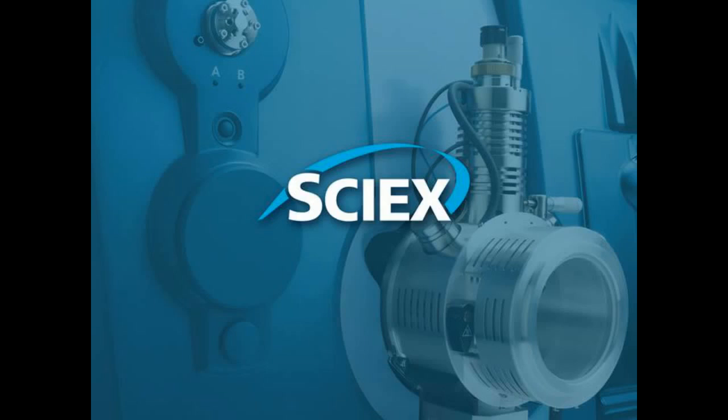Our first question, in the separation of the phosphorylated sugars, how much of each analyte is injected into the capillary? Well, I suppose you're looking at the injection of low microgram per mil. So because they're low mass, the actual loading volume is the order of 10 nanoliters. So you're probably loading picomoles of material onto the capillary. So the actual loading amount is very low.